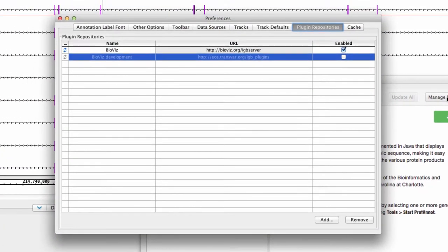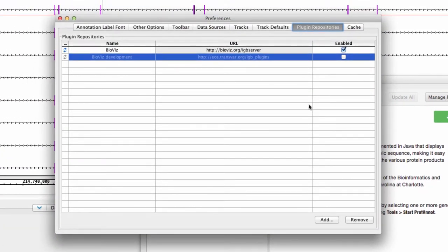Here you will see all of the currently available app repositories. To enable a repository, click on the checkbox under Enabled.